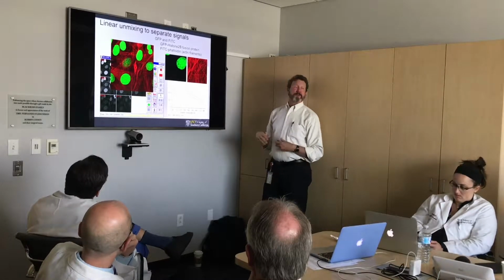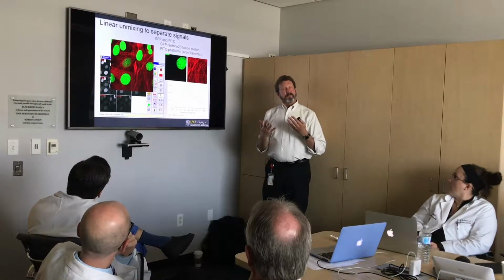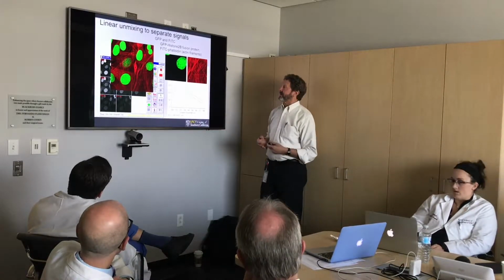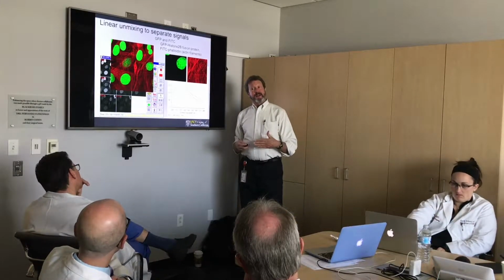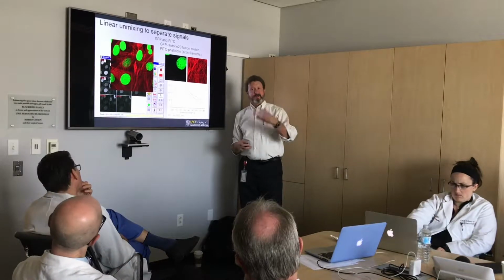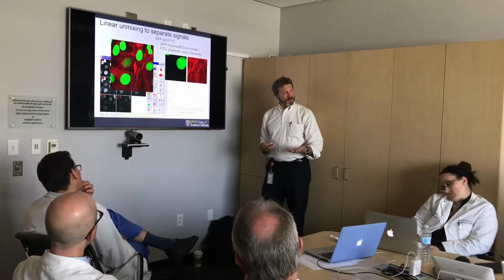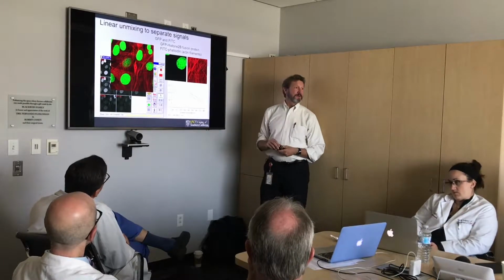There's two problems with that approach. One is that it involves an inversion of some matrices. It's time consuming computationally. And the other problem is that the noise is dominated by the worst channel. So if I wanted to image, say, inside of a person, and the signal I was trying to look at was a vanishingly small signal, that noise from that, just the statistics of that would start to haunt me.